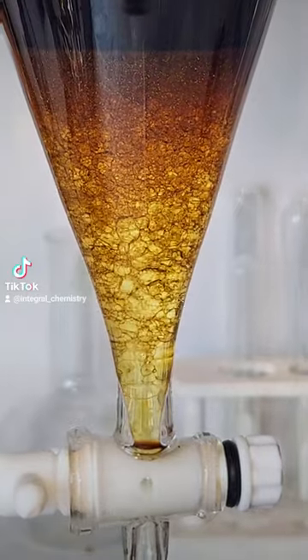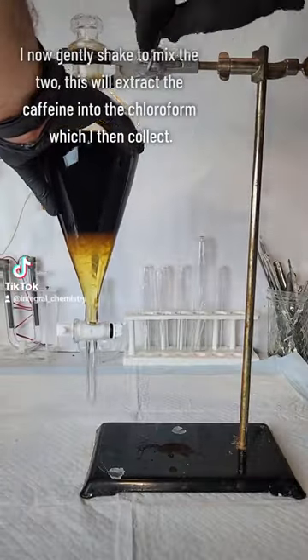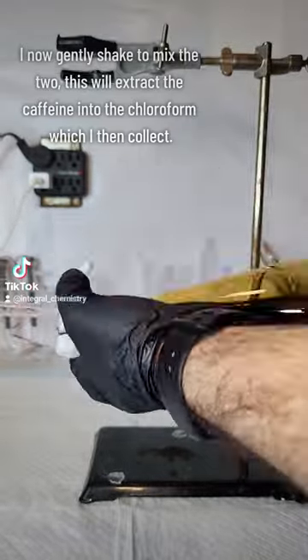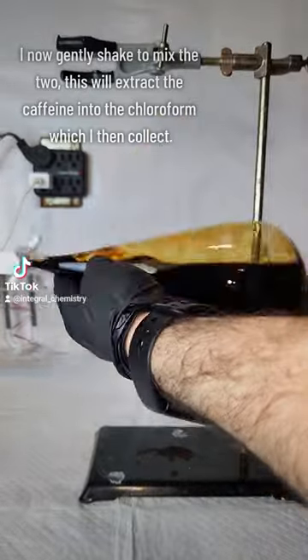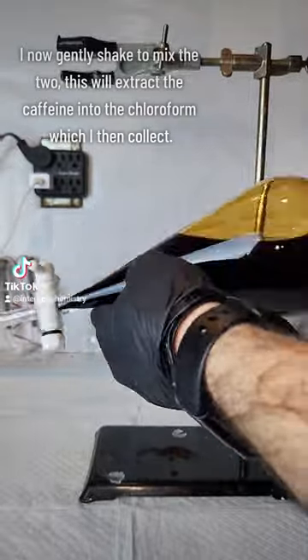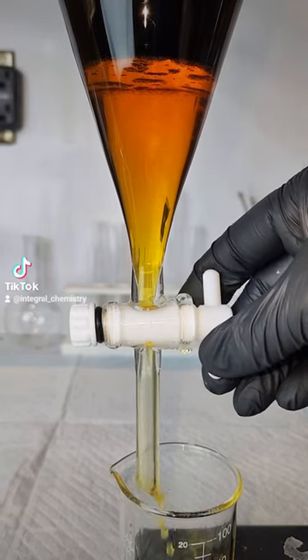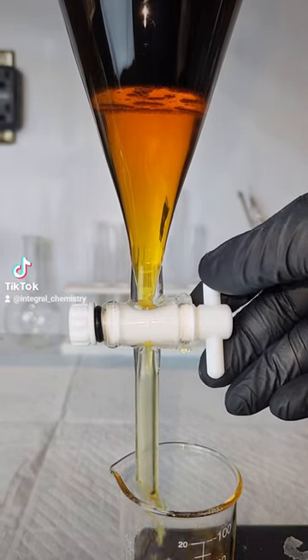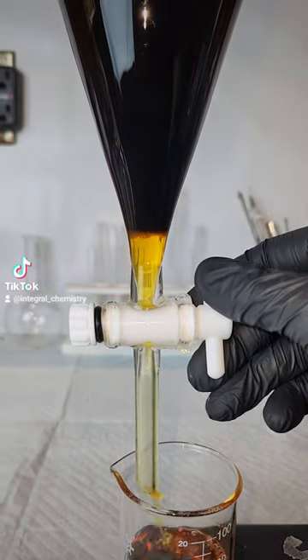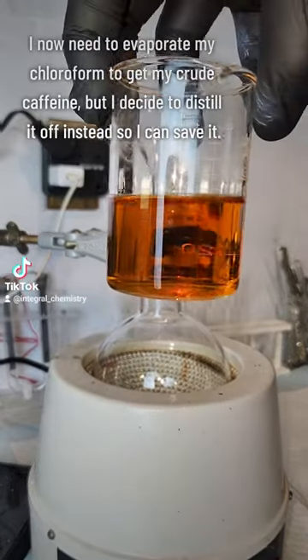Chloroform is also denser than water and insoluble in it, so it forms a lower organic layer. I now gently shake my separatory funnel to help mix the two and extract as much caffeine as possible. Gentle shaking is important, because aggressive shaking risks forming an emulsion between the coffee and the chloroform, which is really hard to separate. After shaking, I wait about 15 minutes for the layers to fully separate, and I drain off my lower chloroform layer. This layer should contain most of my caffeine, so the upper coffee layer is discarded.